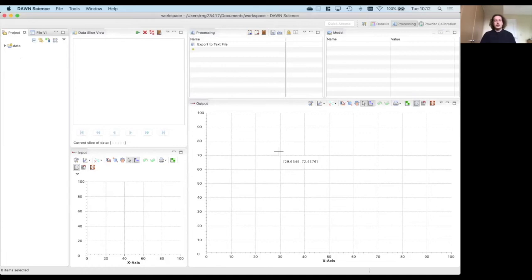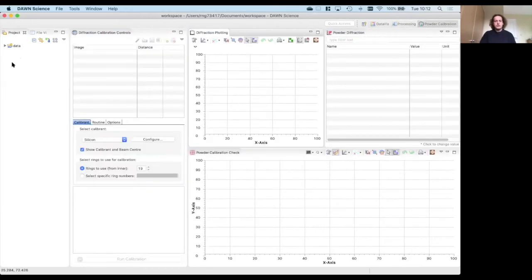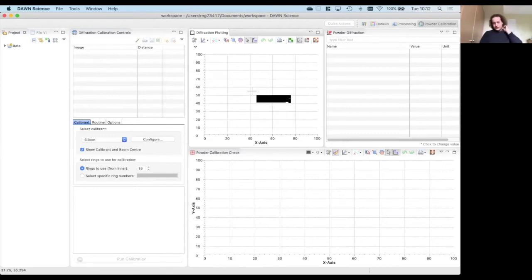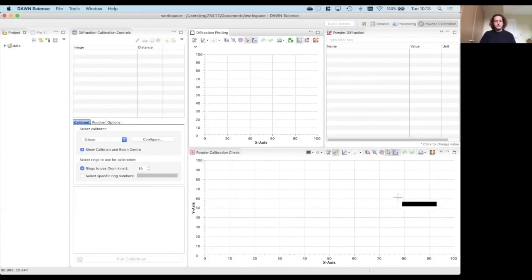There is also a powder calibration perspective, which provides information about calibrants, the image to calibrate against, parameters for fitting, and a check panel that reduces data to 1D and shows calibrant lines as vertical markers. You can see the I versus Q trace or I versus 2-theta trace to verify whether the calibration is sufficient for your purposes.